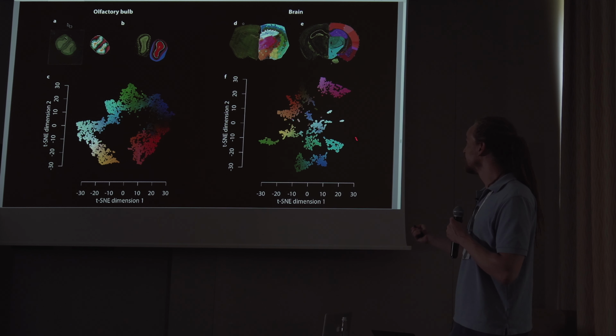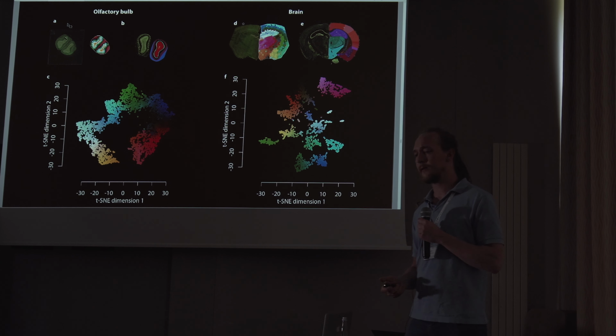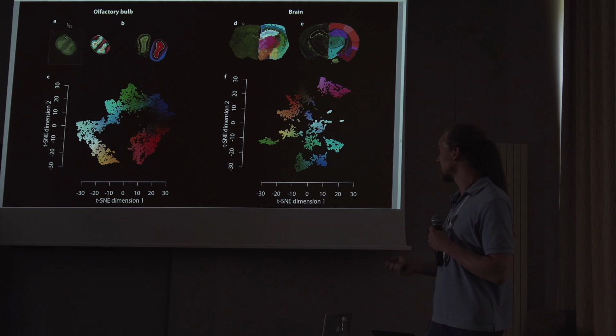On the other hand, for the brain sample, we have what looks like disparate clusters, but hopefully all of you know about this crucial parameter of t-SNE that you want to play with, the perplexity, that somewhat dictates how clustery or continuous the reduction will be.